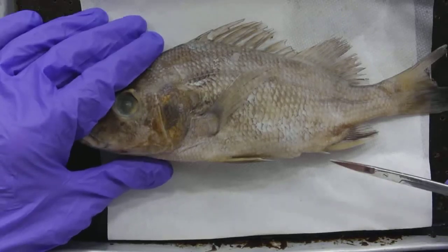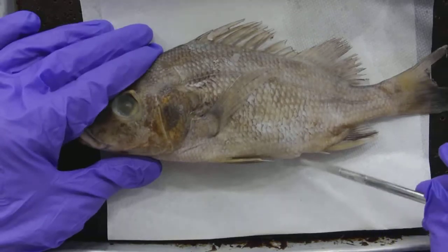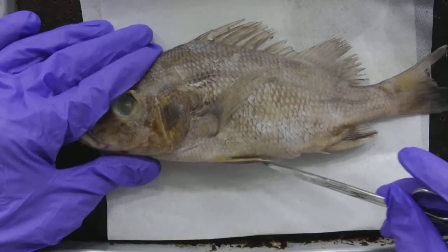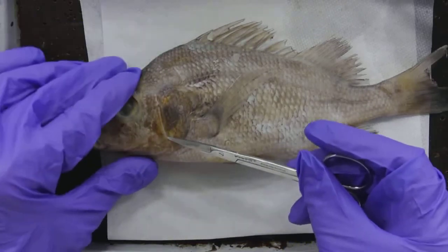The internal anatomy of a perch. To do the internal anatomy we need to dissect open this fish, and to do so I'm going to start at the anus and cut along the ventral portion to right about underneath the operculum.